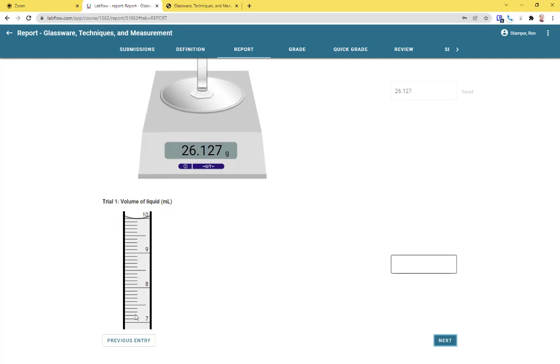When we see an analog scale, like this graduated cylinder with the liquid in it, we're homed in here on the value, right? So this is a 10 milliliter graduated cylinder. What I want to note here is that each one of these tick marks must represent a tenth of a milliliter, right? I've got 9 here and 10 up here, and there are 10 little spaces in between. Whenever I'm reading an analog scale like this, I want to read the number that I can see, essentially the smallest marking that I can actually observe, and then I'm going to estimate one more digit.